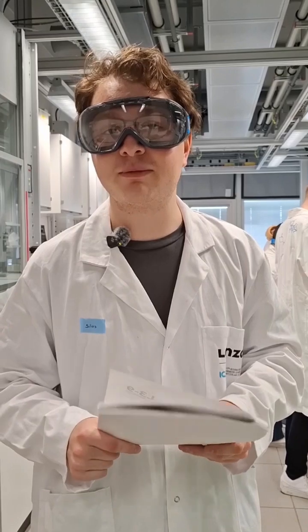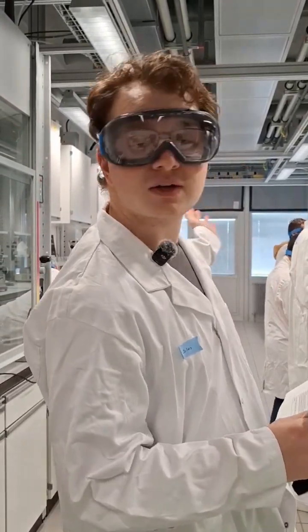Today is quite a special lab because it's the first time we're here at the Physical Chemistry Lab at ETH where the students are taking a look at chemical kinetics.